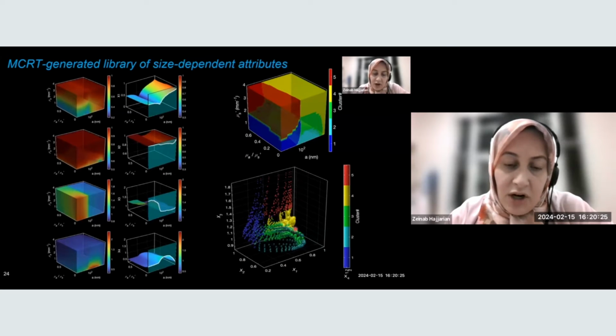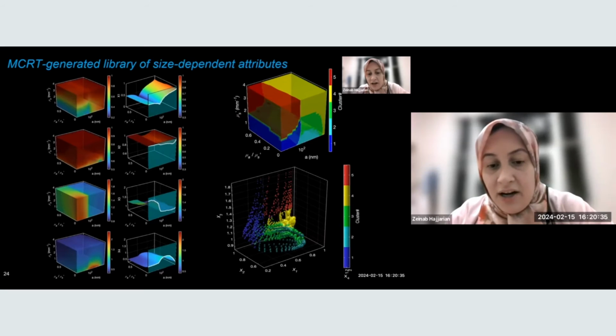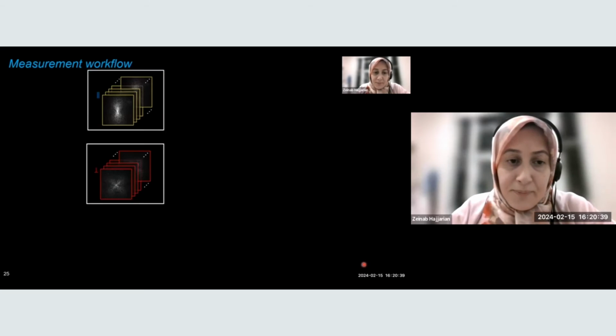This is the scatter diagram of the particle size. The volume of the marker represents the particle size, and then these are the 4 attributes that are quantified there, and the cluster number is encoded in the color. The 4th attribute is represented by the shading of the markers.